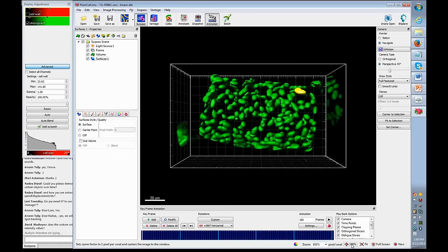Then finally, you actually get some tracks. By default, it's going to filter out very, very short tracks that are only a couple of frames long. And you can, again, add other filters if you wanted to look for tracks of a specific duration or straightness and so on. At this point here, you have your tracks and you have some information regarding the tracking.